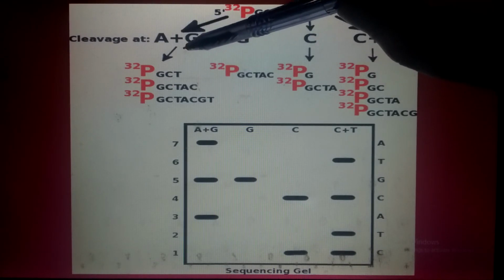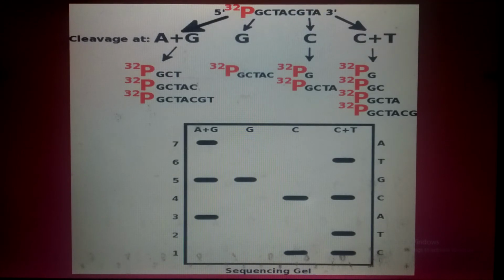Okay. Now you can count the G. G is here. G is here. Is it clear? So the first fragment must be produced here, but it is not produced here, because this is the single. So at G, after modification, the DNA formation will be stopped here. Now what will happen? The second step: the modification occurs at this G.